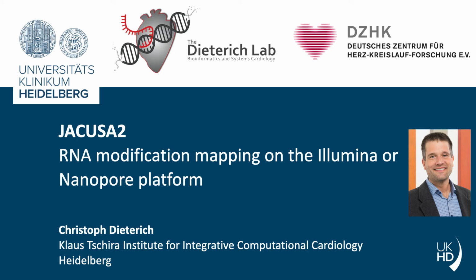Ladies and gentlemen, welcome to my presentation on Jacusa2, which is software for RNA modification mapping on the Illumina or Nanopore platform. My name is Christoph Dieterich and I'm based in Heidelberg. My lab is excited about RNA research.